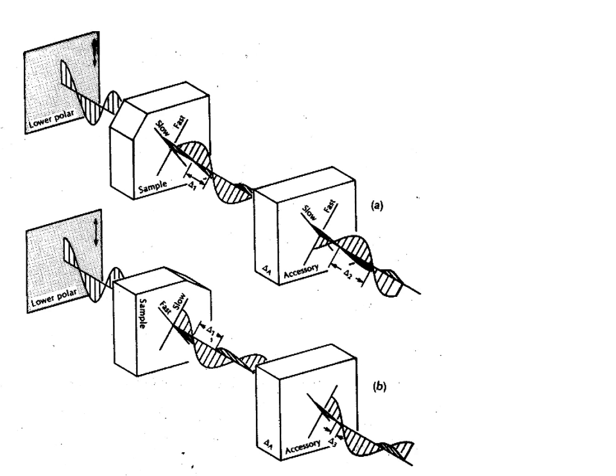Now, for comparison, the second ball, below the first one, has the opposite sense of retardation in the mineral grain that's unknown on your microscope stage. So you say it's rotated 45 or 90 degrees away from the previous example. The accessory plate on the far right is still oriented the same because it can't move, but the unknown sample is vibrating in the opposite sense. Its fast ray is now in the upper left and the slow is in the upper right.